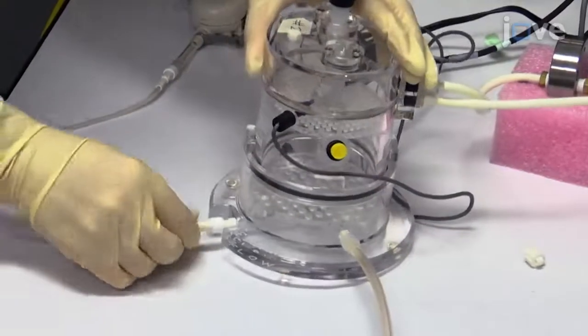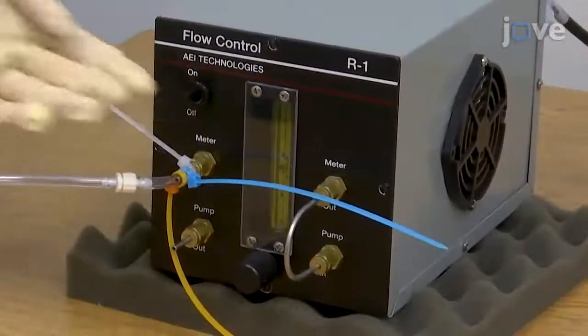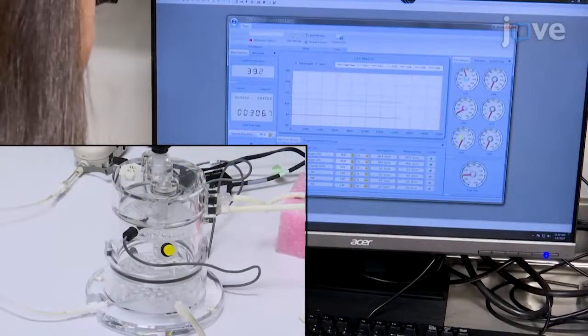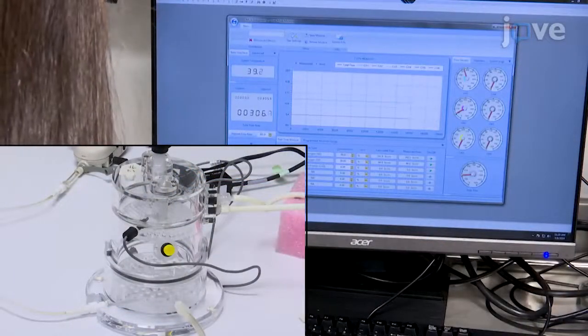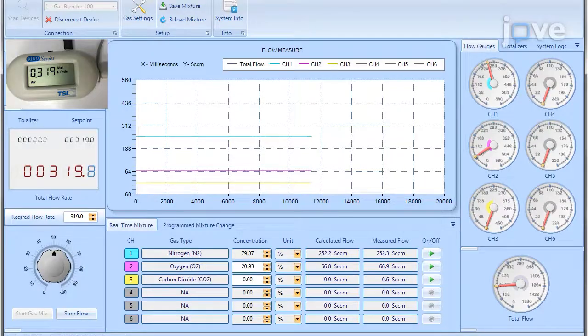Then reattach the inflow tube and turn on vacuum flow to calibrate the high flow and to allow 20.93% oxygen-balanced nitrogen gas to flow through the barometric plethysmography chamber from the gas mixer.